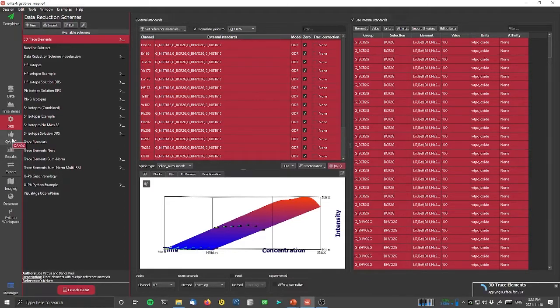And as we'll see once it finishes calculating again, in this case again, it doesn't make a really big difference, but remember, we didn't have to have any knowledge of a particular internal standard element to be able to apply this correction.